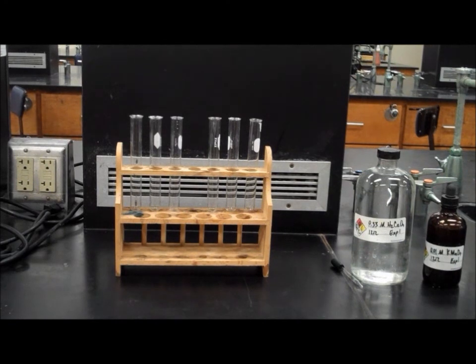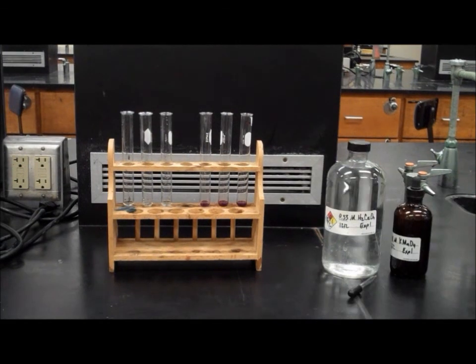First, collect six clean, large test tubes and place them on a rack found in the cabinet labeled test tube racks. Fill three test tubes with permanganate solution and fill the other three test tubes with oxalic acid solution.